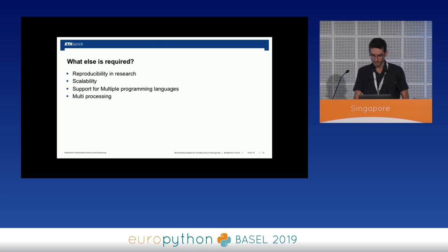And yeah, multiprocessing, because this data is such that I cannot run the experiments on my local machine. We are using computational clusters. And since we have multiple nodes, we try to make use of multiprocessing a lot. And yeah, cluster execution for two reasons. One, there's not enough memory in my local machine. Second, there's not enough time, because we need to run things in parallel.